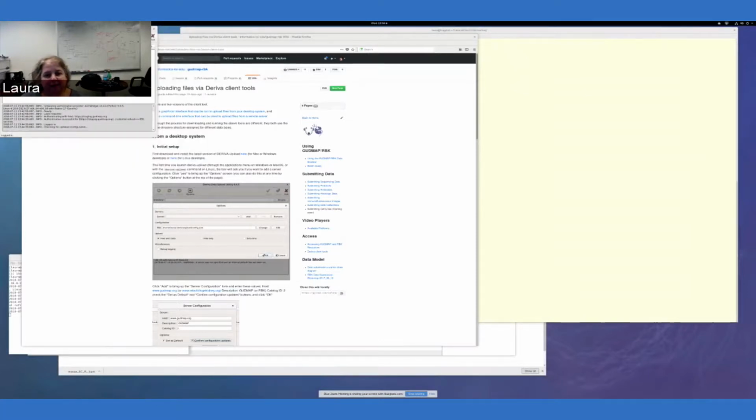And then I'm logged in, and if you look very carefully at this window, it will say logged in. And if you can't see it, just believe me, that's what it says. I don't know if there's a way to make this display any larger.